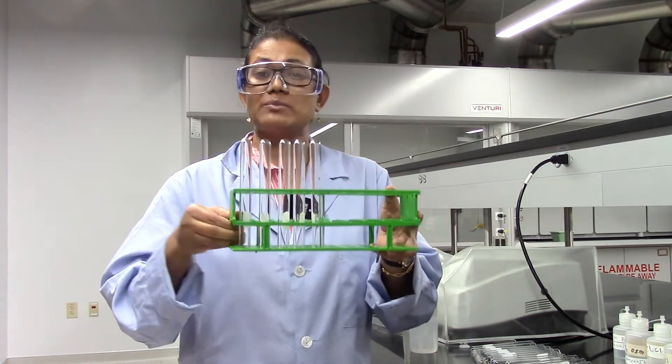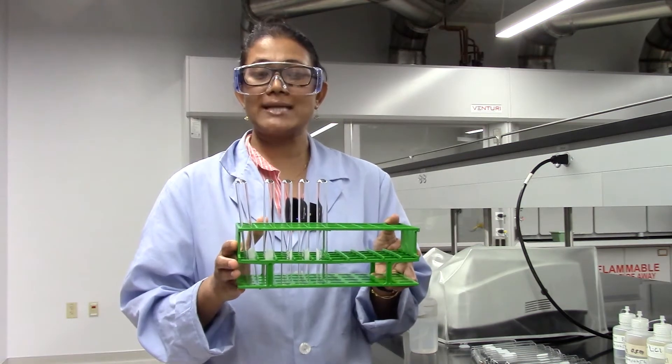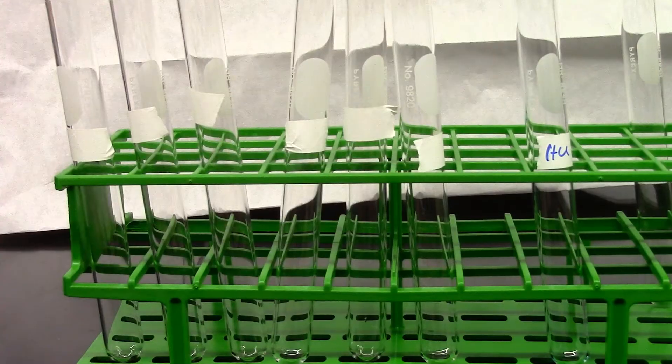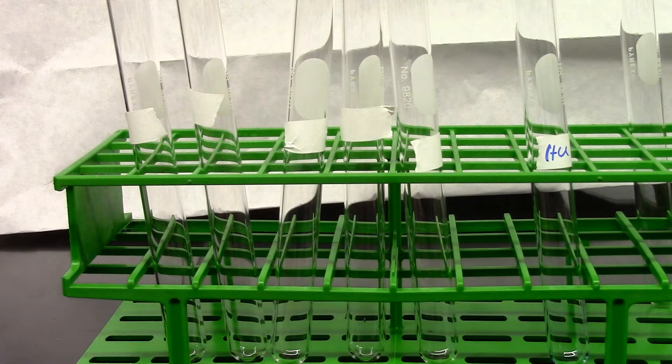We need a test tube rack with some clean test tubes, and we are going to use six different metal ion solutions. We are going to add 10 drops of each metal ion solution to each of these test tubes. I have got six test tubes for the different metal ion solutions, and I'm going to quickly go ahead and label them.